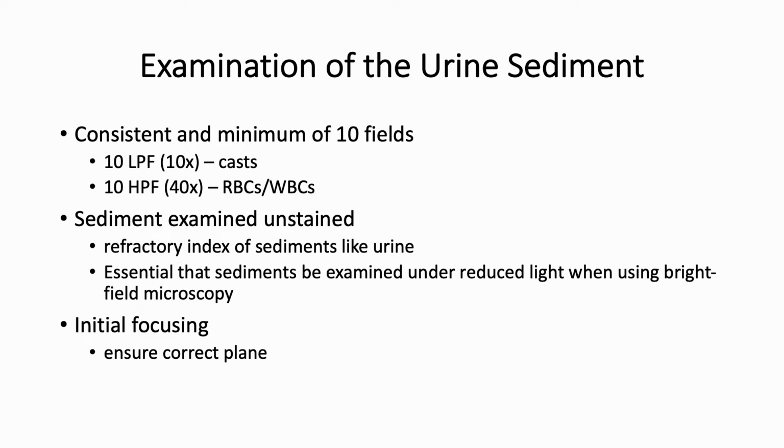Initial focusing can be difficult when examining a fluid specimen, and care must be taken to ensure that the examination is being performed in the correct plane. Often an epithelial cell will be present to provide a point of reference, and focusing on artifacts should be avoided because they are often larger than the sediment elements and can cause the microscopist to examine objects in the wrong plane.